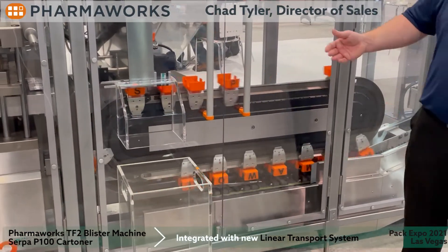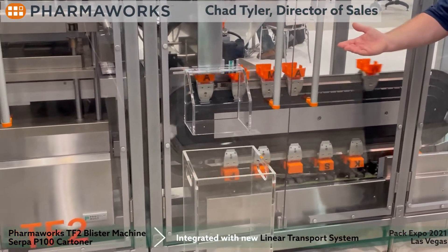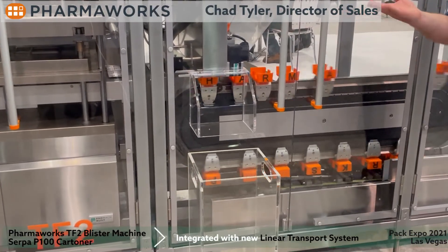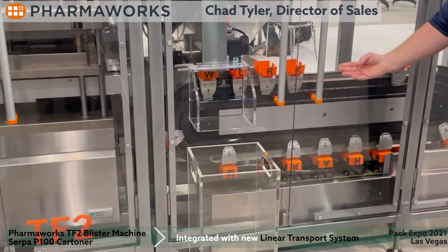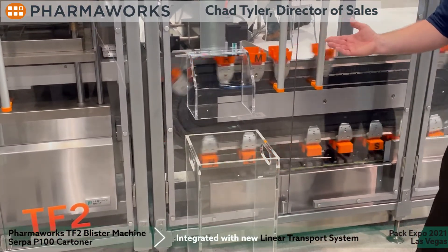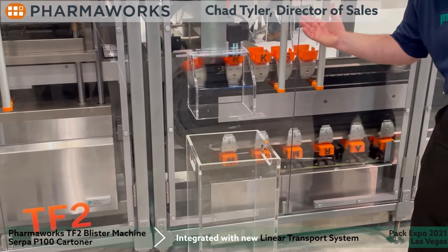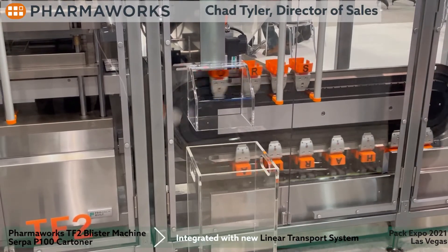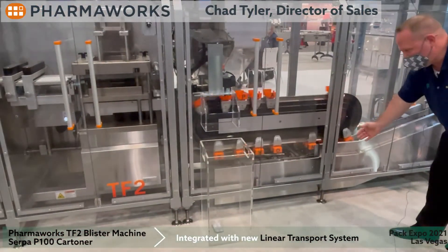Basically what we have is our overhead vacuum transfer that picks up the blisters from the punch station, transports them out to a stop location, and then we push them into the buckets of the XTS. The XTS is utilizing gravity to hold the blisters in as we pull them around. And as you see, we transition to the bottom.